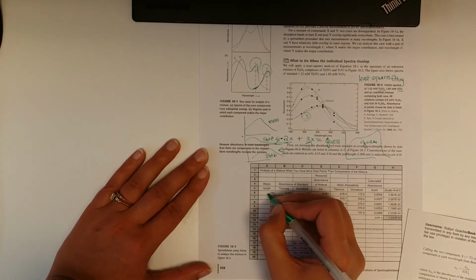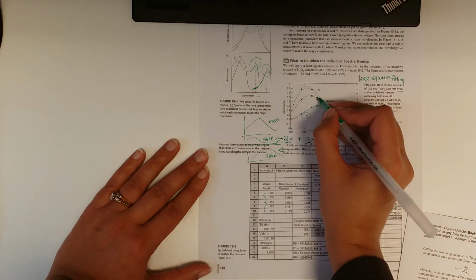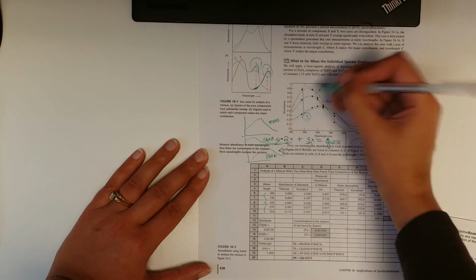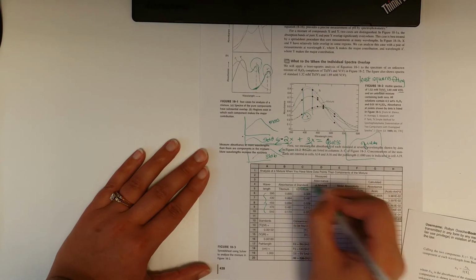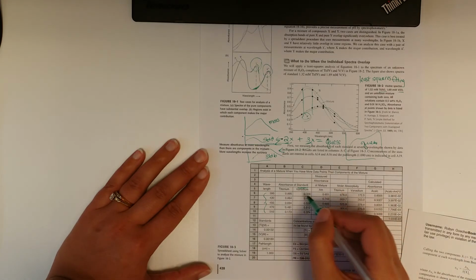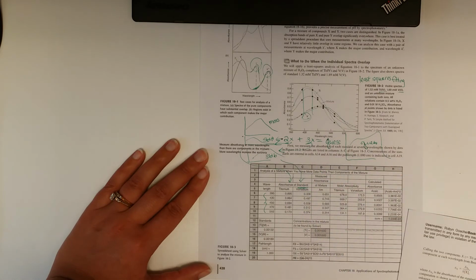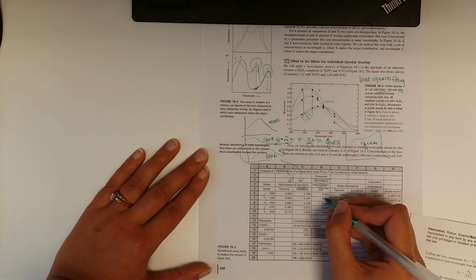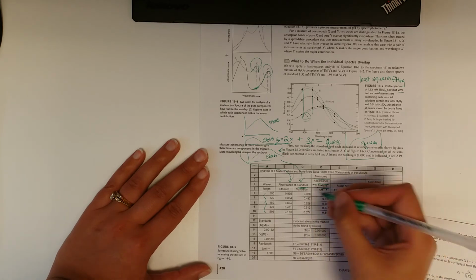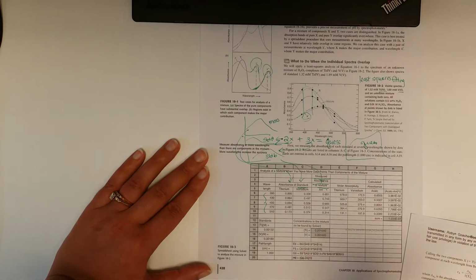You have the 5 wavelengths, okay, which you chose, and that's these 5 wavelengths here. So that's a wavelength, that's a wavelength. You have the absorbance of the standards. So this is measured. It's a standard A, standard B. And then you have a measured absorbance of the mixture. You don't know the concentration of the things in this mixture, but this is a real measurement. That's your measurement here.